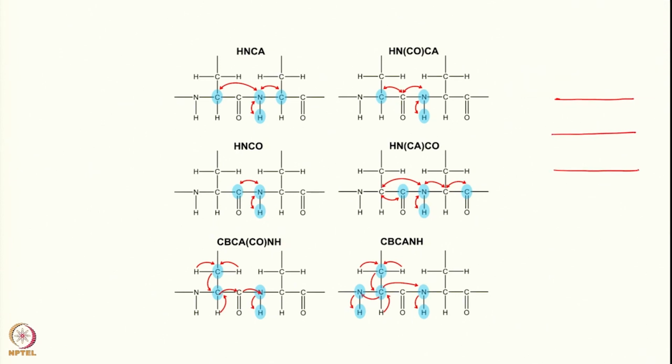So you need to be able to apply pulses along the 3 different channels. Okay. So you apply various pulses there, and finally you actually collect the data only on the proton channel. In between, the magnetization flows through different nuclei, which I will explain to you. Now we take one by one and see how this works.